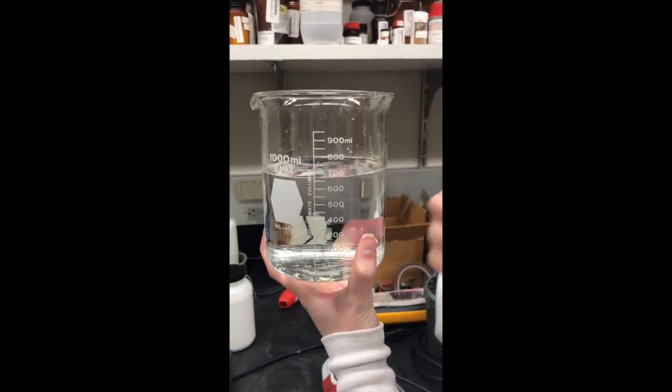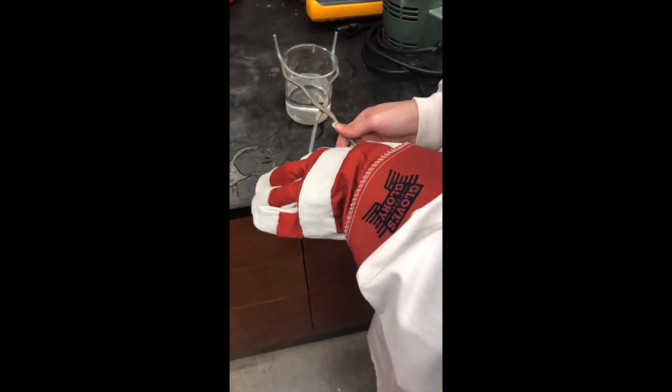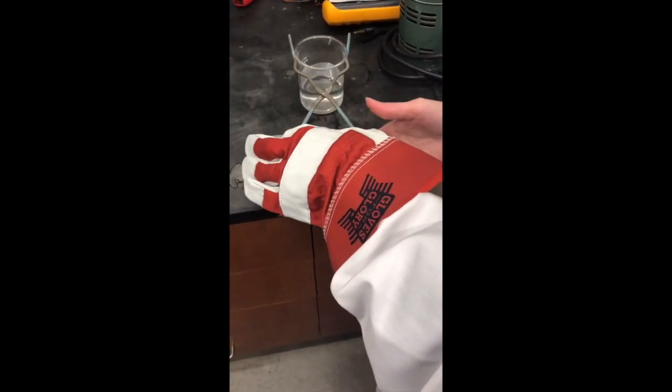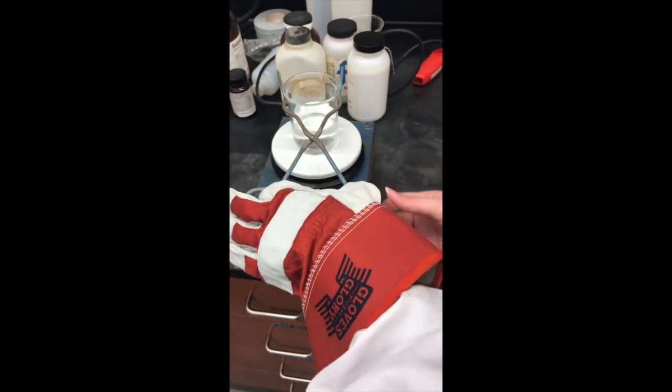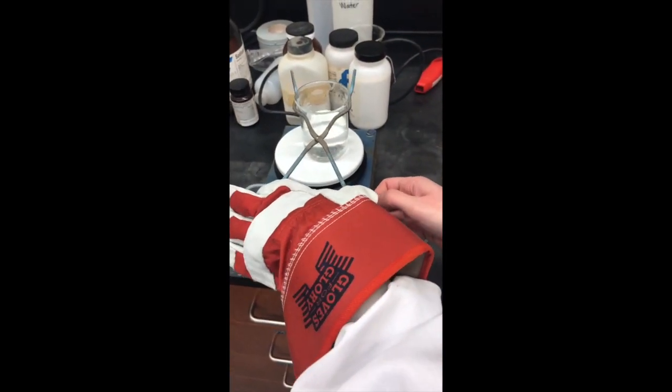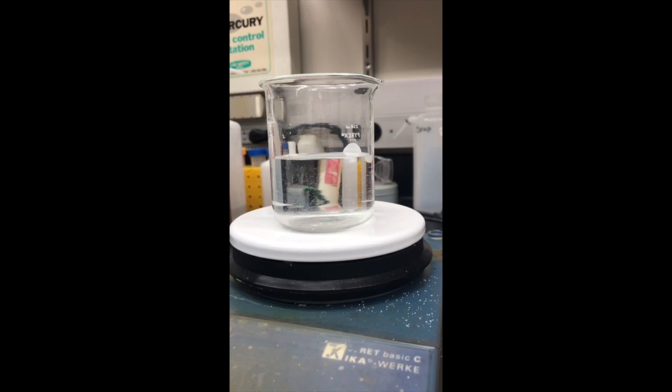Never fill your glassware above the fill line. Make sure to use tongs to protect the gloves from picking up hot glassware. Don't allow solutions to boil violently.